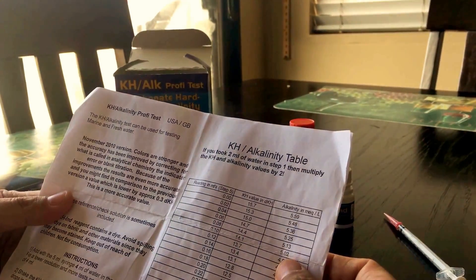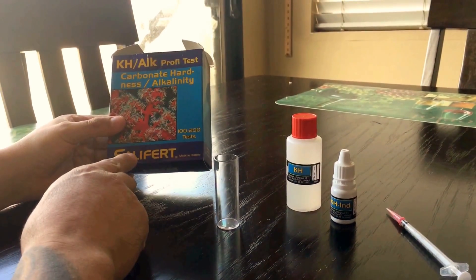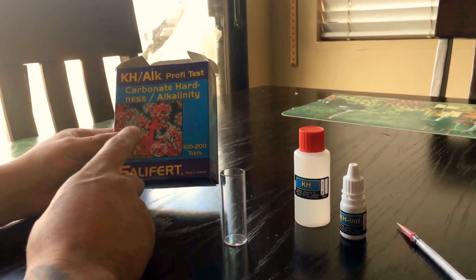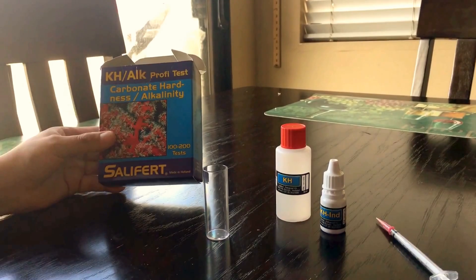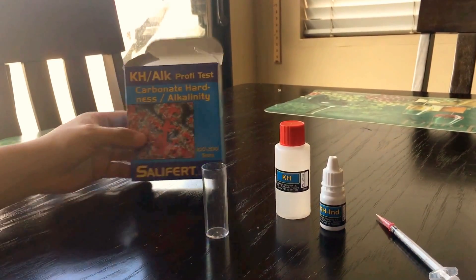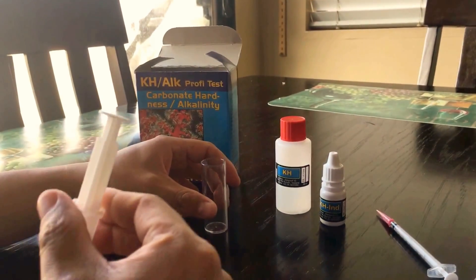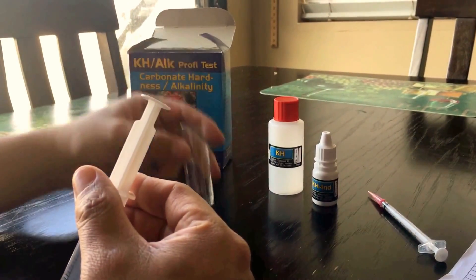I used to use a calcium Salifert test but I upgraded to the Hannah calcium test kit, which I like better. I'll probably upgrade to Hannah for alkalinity too soon. But today I'm gonna show you how to test — it's really simple and easy. I test my water probably two to three times a week for alkalinity and calcium.